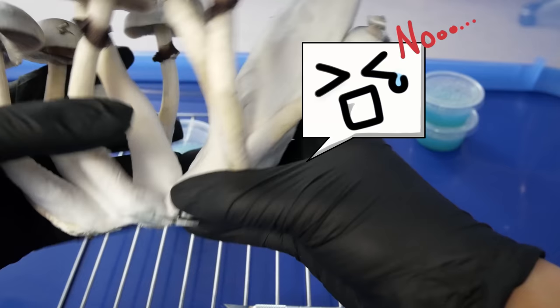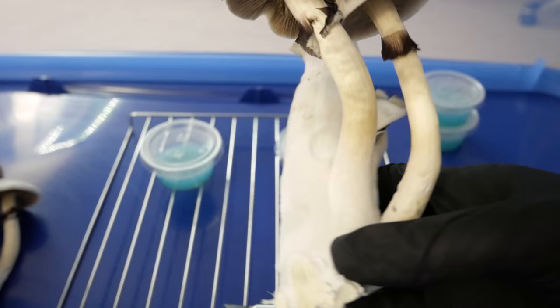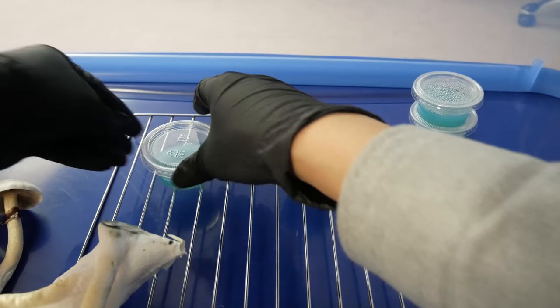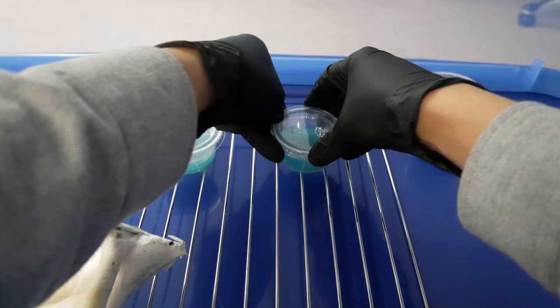Here I'm going to separate this big fruit body from the rest of the cluster to make it easier to work with. Now we'll go ahead and prepare my agar cups, I'll loosen up the lids here to make it easier to transfer the tissue onto the agar.